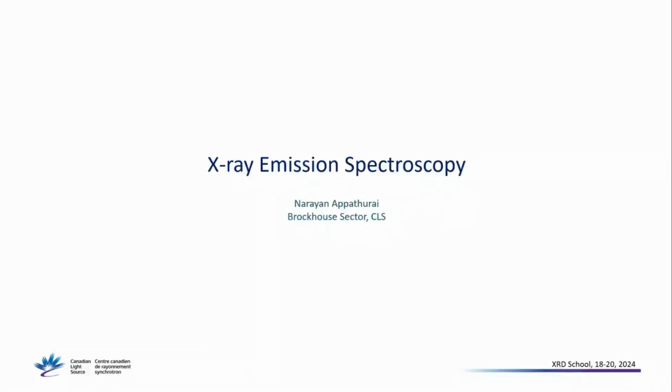Please, to have energy to listen a little bit about X-ray emission spectroscopy and not about diffraction. The motivation of this talk is we have recently commissioned a prototype in-house built X-ray emission spectrometer. The instrument is almost ready for the users. We haven't given it out yet. So I will go through, in the next 30 minutes, the design and construction and how it works.